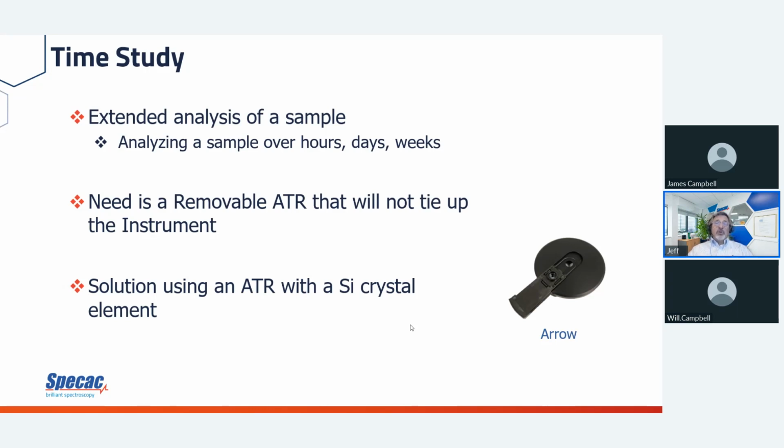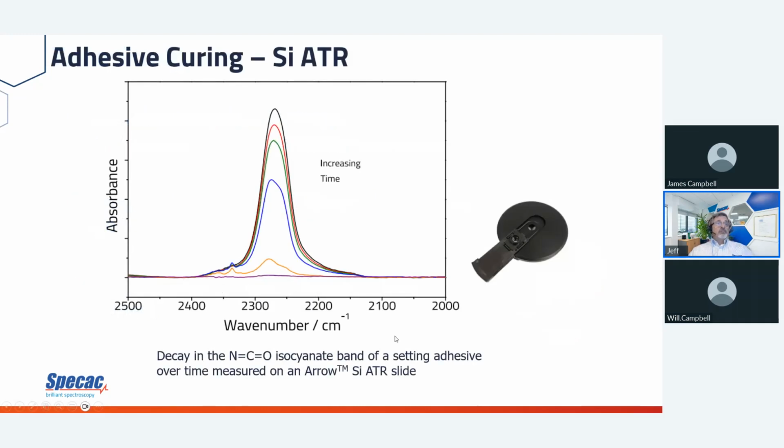You're able to take this and put it on the side, and it works great for that. Or if you want to have that stored, you can put your sample in here, put a cap on it and put it on the side, and you can have that for further use.